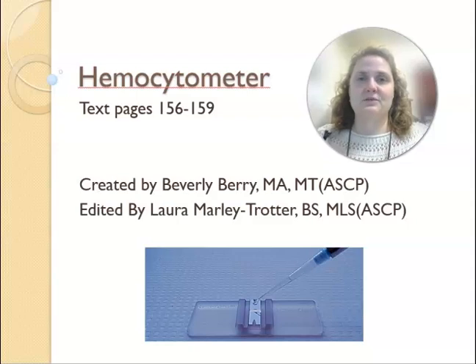Welcome back to MLT 120. Today we're going to learn how to use a hemocytometer.